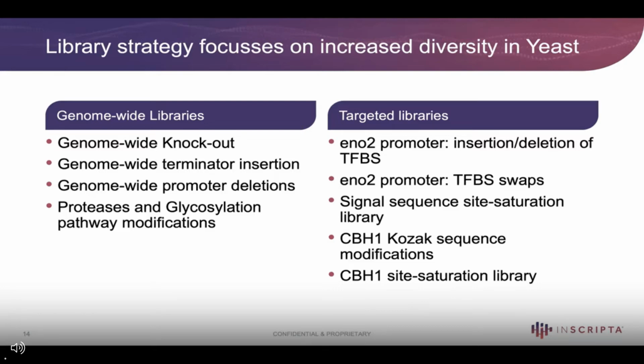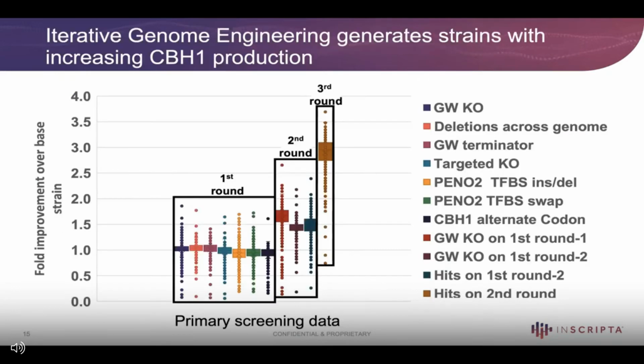So it's really exciting to be able to automatically generate these types of libraries, where the real fun comes in the phenotyping that comes off of the instrument. We can grab those and do phenotyping and execute on that right away so that we can get from conception to reality very quickly. And what's fascinating is we ran all of these screens with thousands of colonies.